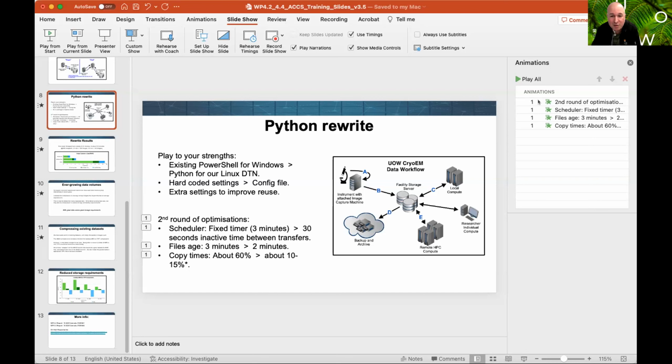So I suppose we had two steps, Roland. We had the first step, which was the live processing that was happening in real time as the images were being captured, and then there was data sent down to Massive at Monash for further, more detailed analysis.